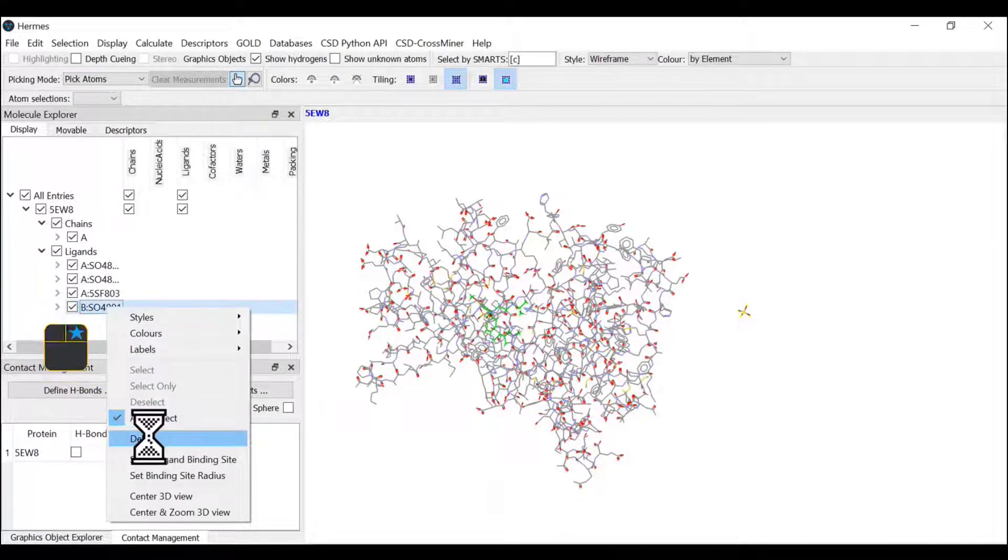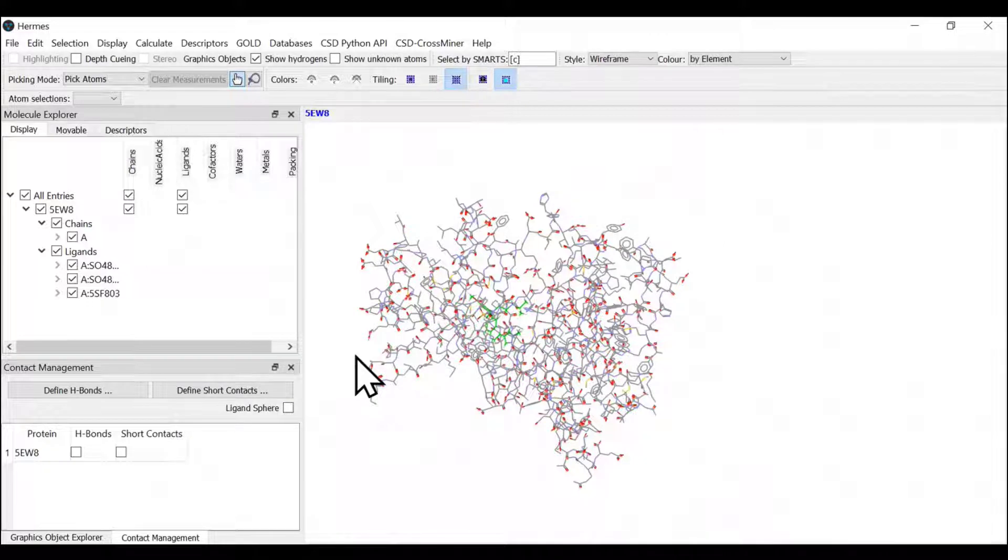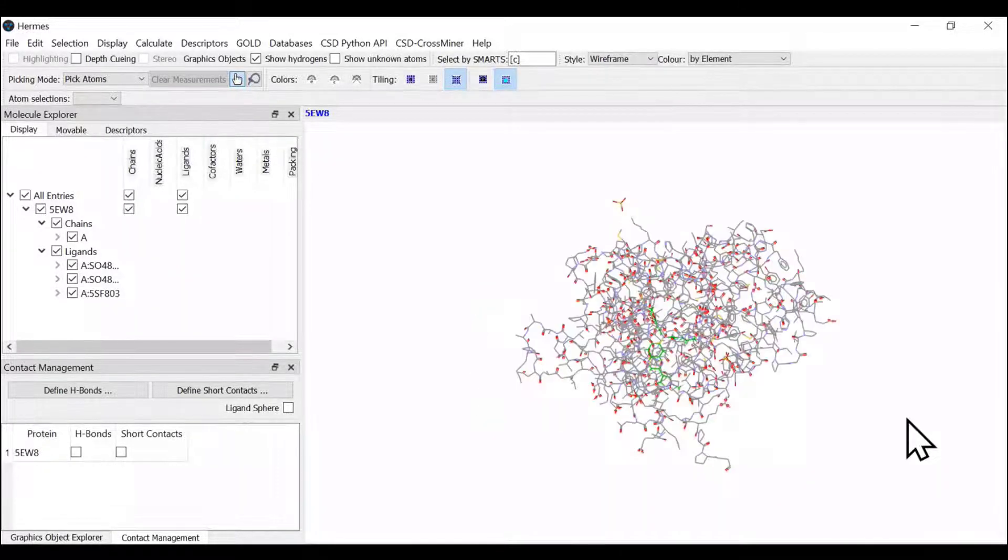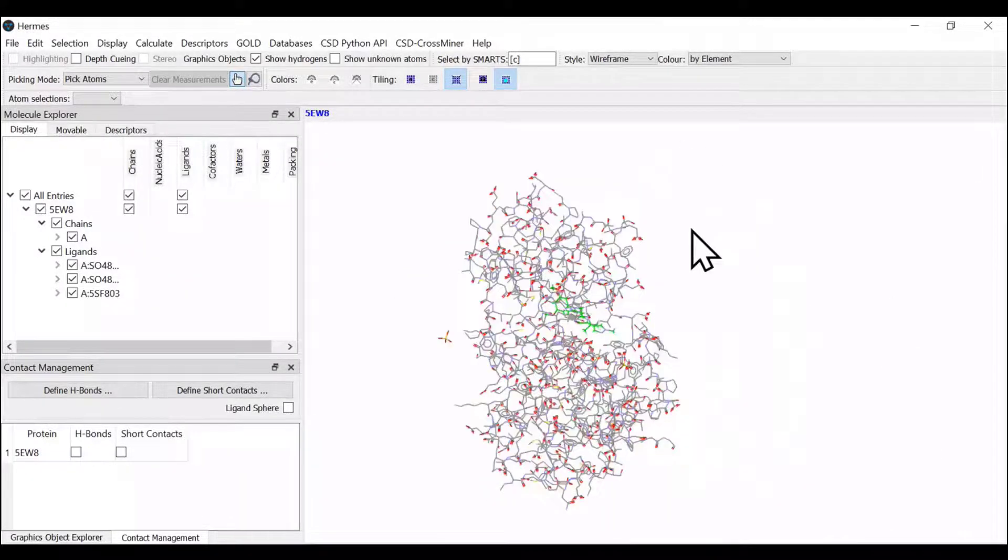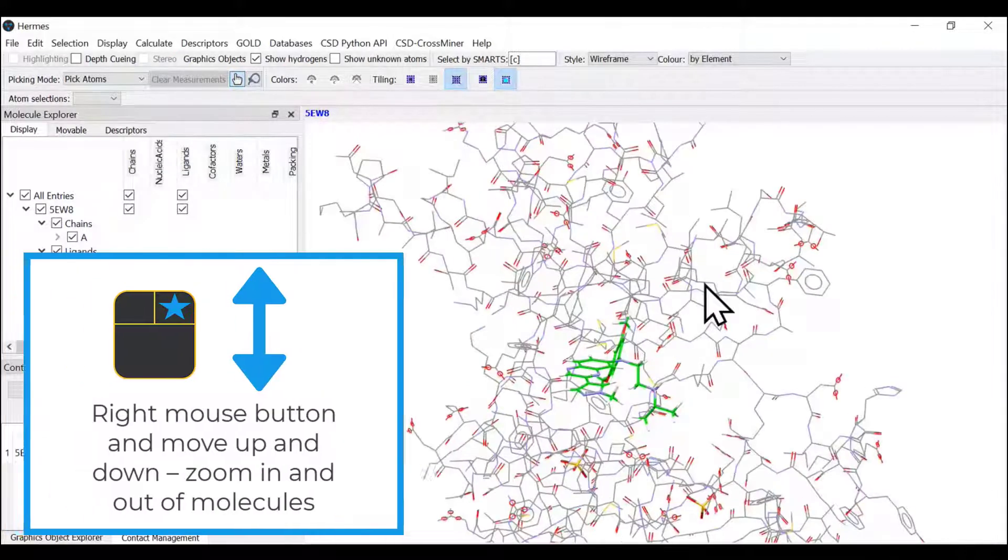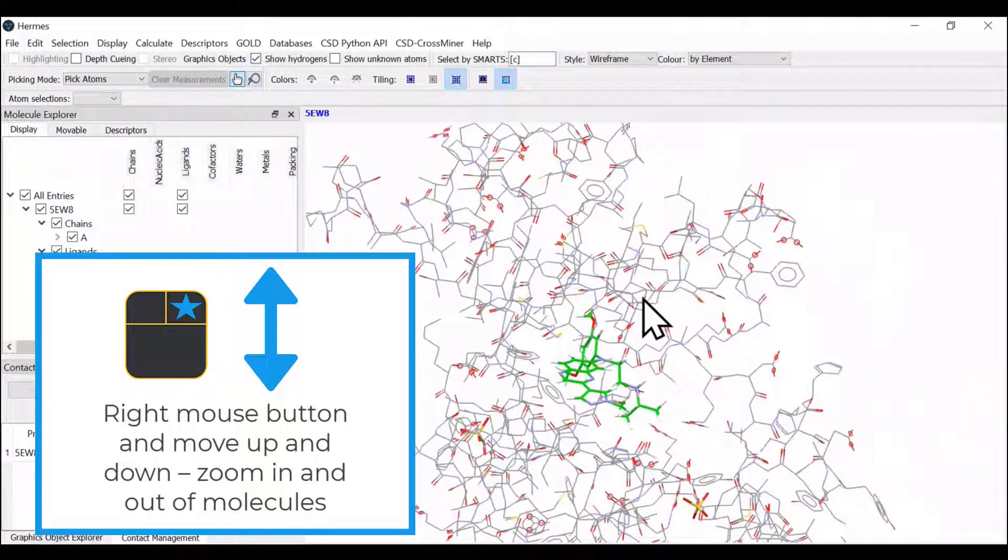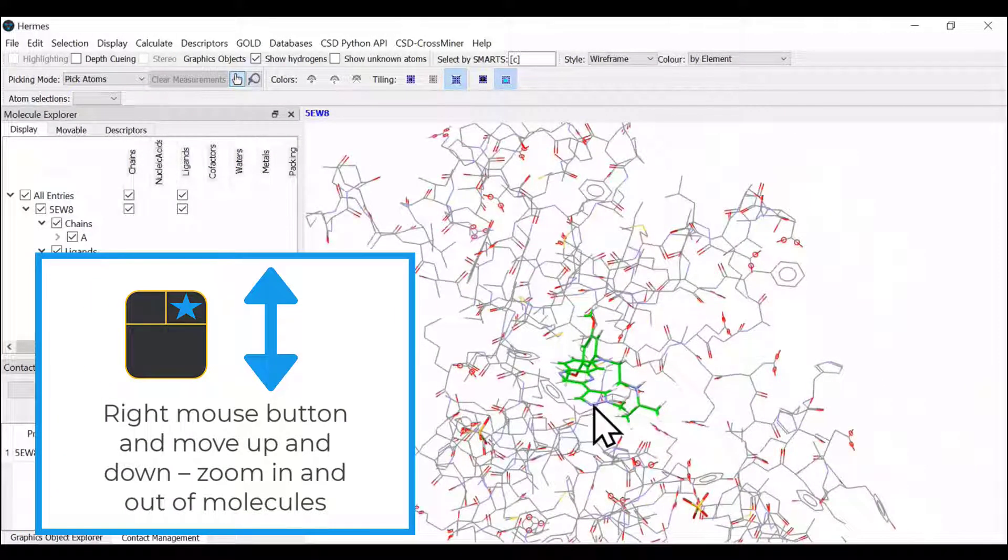We have removed all the ligands from chain B as well. What we have is our structure of interest here. We have chain A and the bound ligand.